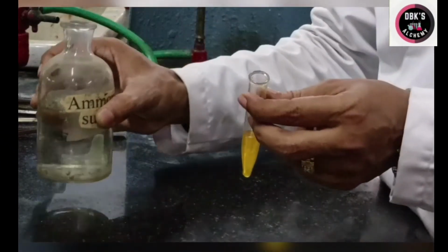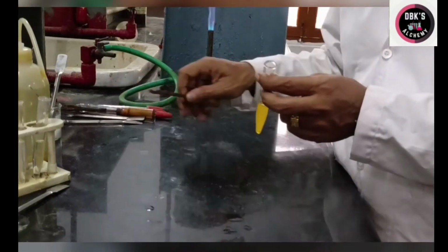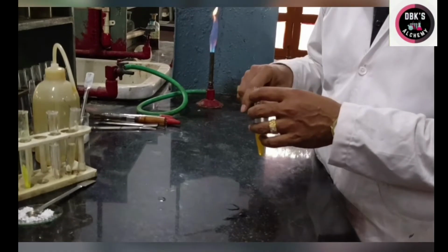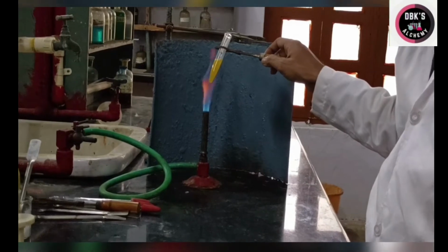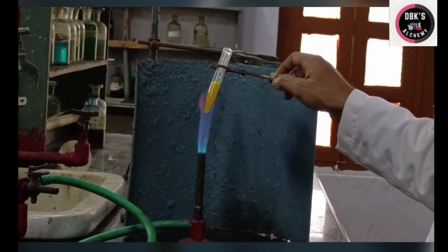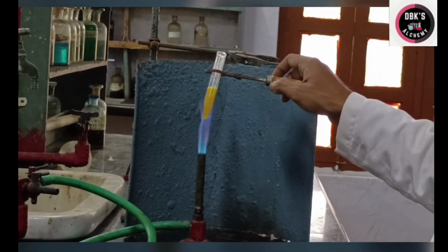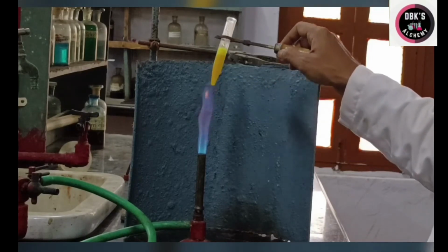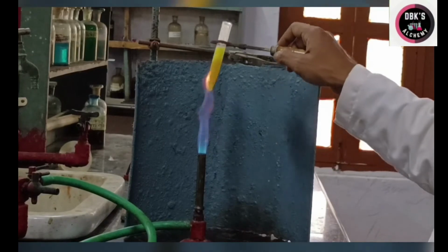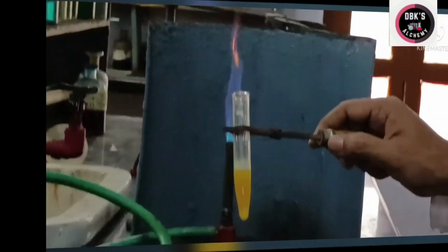I have added ammonium sulfate. Now I have to heat this solution. For heating, make use of the test tube holder. Always place your test tube at this place of the Bunsen burner for heating. You have to do on and off heating. Don't heat continuously, such that the solution gets bumped. Okay, now I have heated.